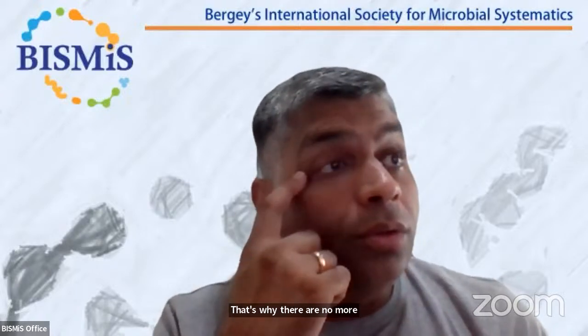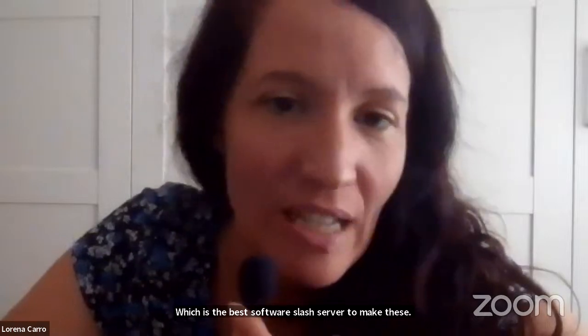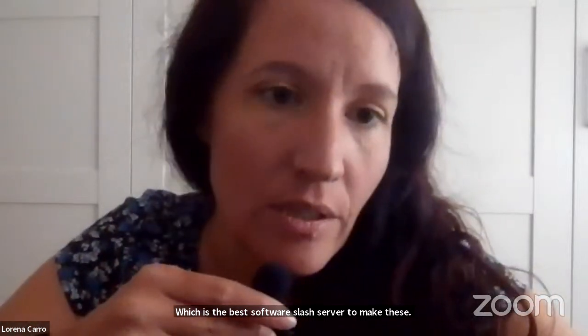There's just one question that has popped up at the last minute. We have seen very interesting, eye-catching genome annotation figures. Which is the best software or server to make these? For me, the one that I like most to generate this kind of image is iTOL. Yeah, iTOL. If you can type the link in the chat, I can send it to all the participants.